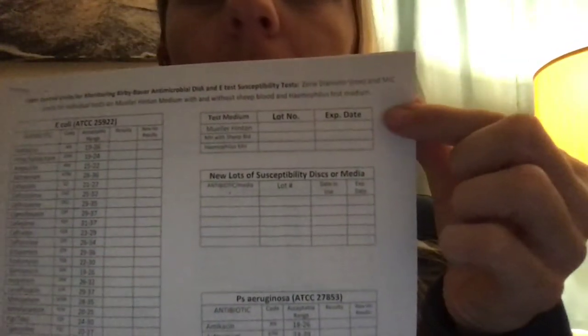This form is also available electronically on our intranet if you ever need assistance outside of this video. One last thing: when you select your Mueller Hinton plates for your Kirby-Bauer, make sure you're selecting the newest, most recent lot. There is a little box where you can list the lot number and expiration date. The same goes for any new discs you choose to use for your weekly QC. Thanks.